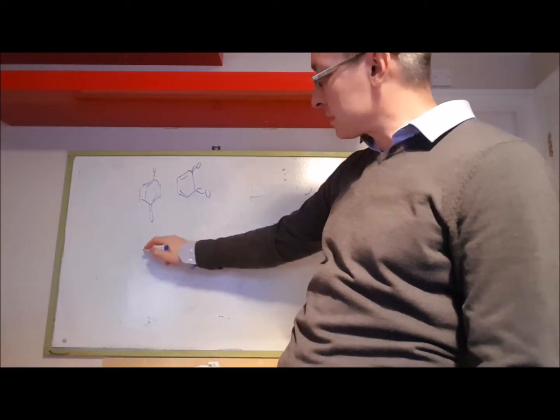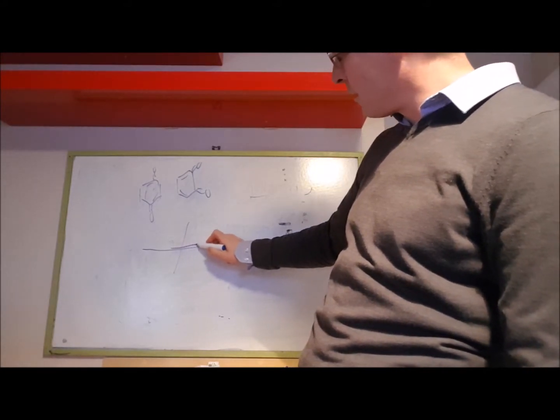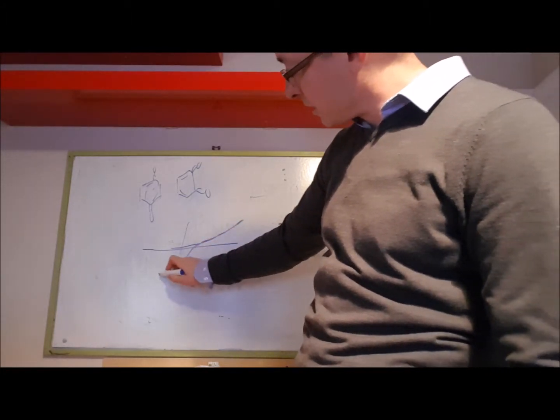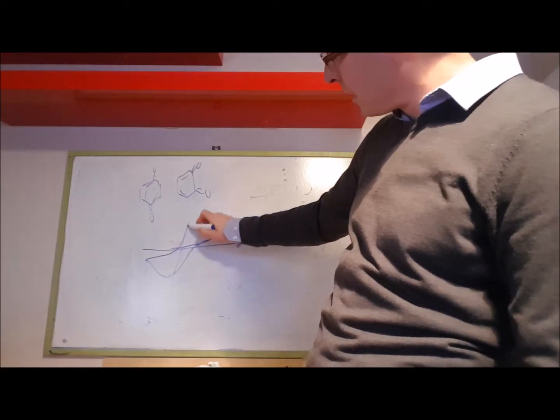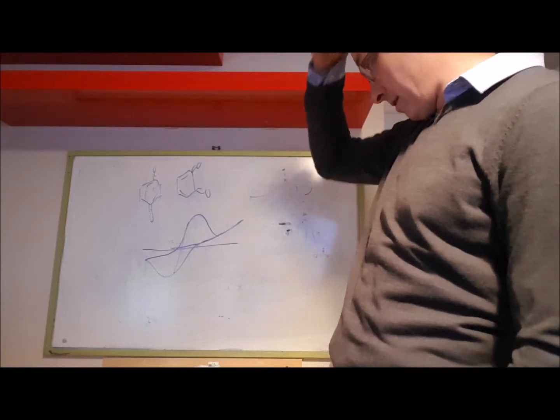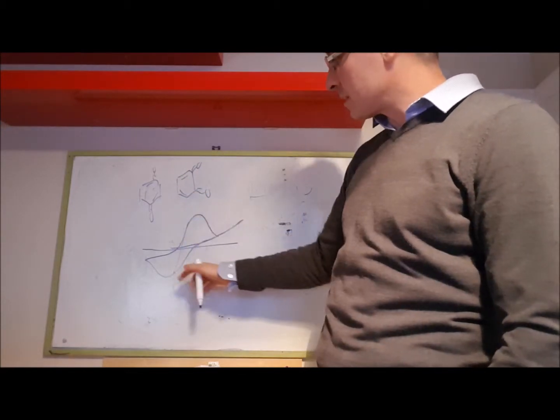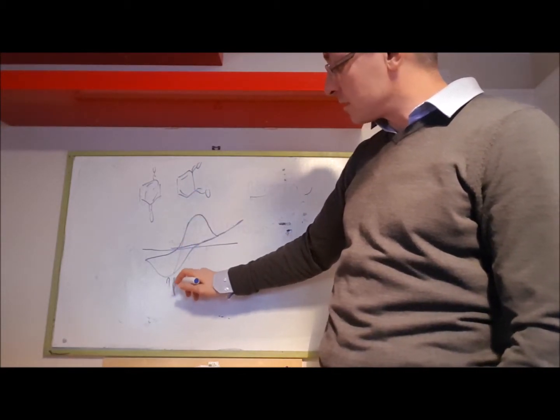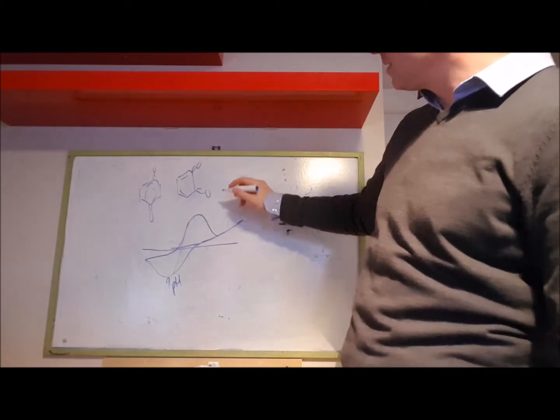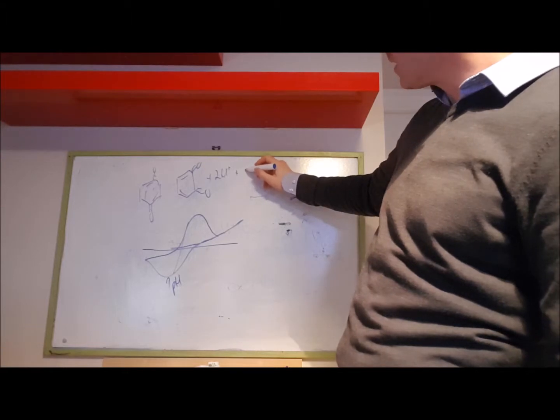These kind of molecules, if you have these present and I did a CV, if these were on the carbon surface, I would expect a CV like this: you would come up, not really get much activity. When I came back down again, I might get a reduction peak, and then when I came back up again, I would get a sort of oxidation peak. Now, I'm thinking, if your surface has these kind of moieties on it, these peaks will be pH sensitive, because the reduction of either of these is going to require 2 hydrogens plus 2 electrons.